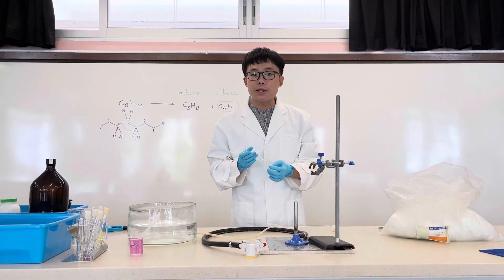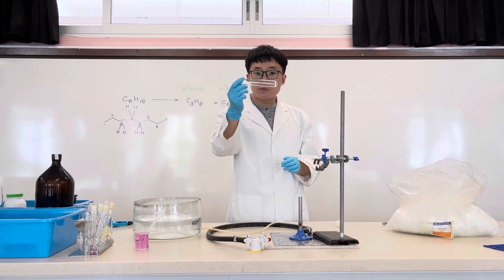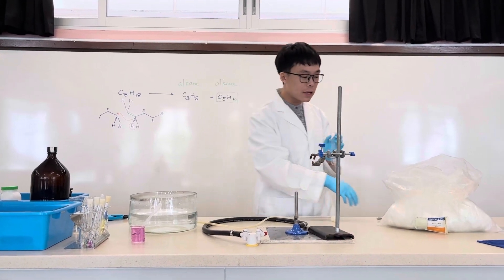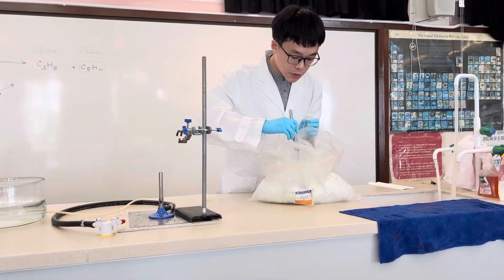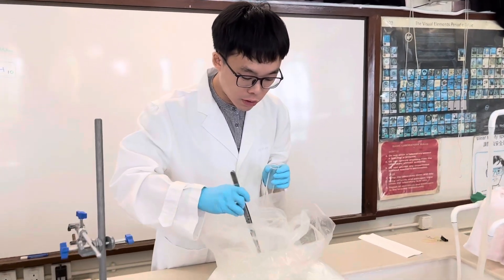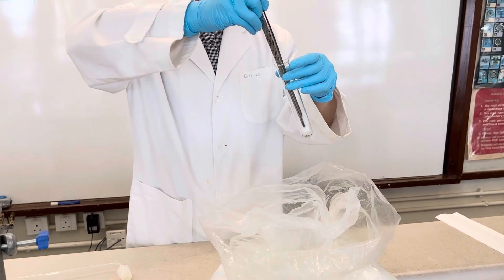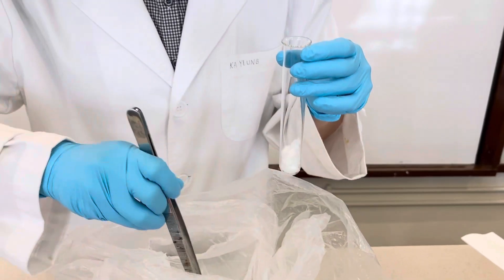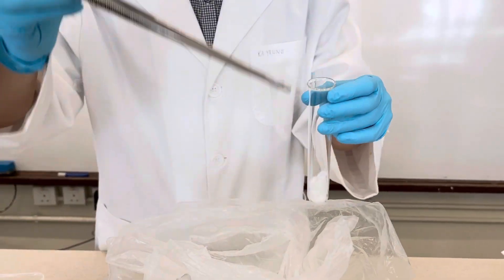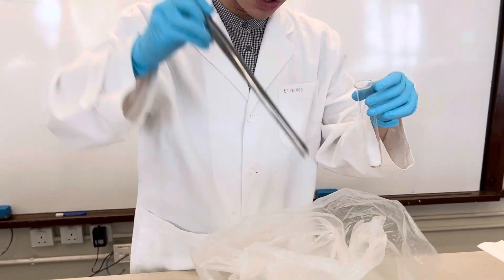Today we are going to demonstrate cracking of medicinal paraffin. I have a long boiling tube here, and what we have to do is add some mineral wool into it, placing it at the bottom of the boiling tube.